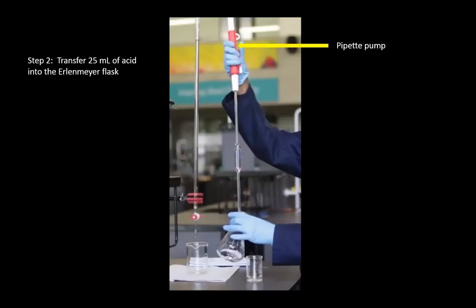Step 2, transfer 25 milliliters of the acid whose concentration we want to determine into the Erlenmeyer flask. At the top here, the person is holding a pipette pump, which is used to draw the liquid up into the pipette. The details of how to use a pump or a rubber bulb will be shown by the instructor once you get into the lab.